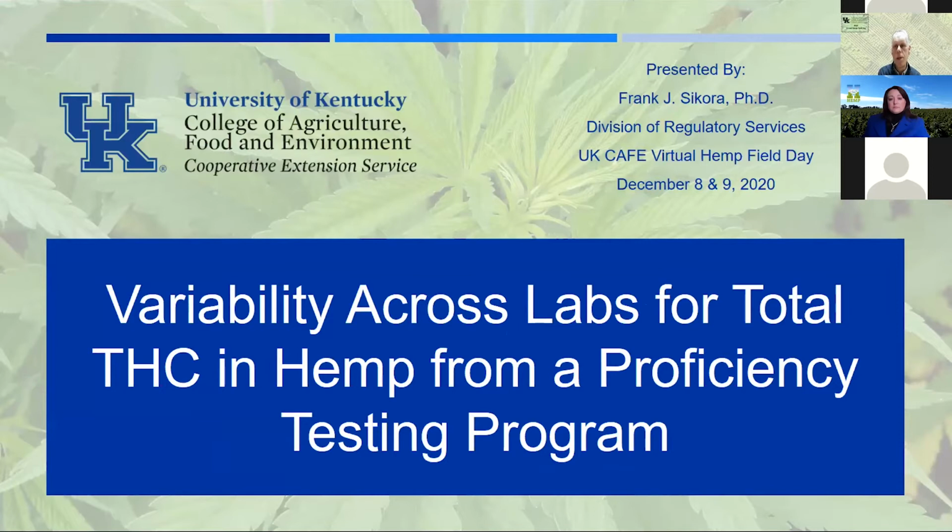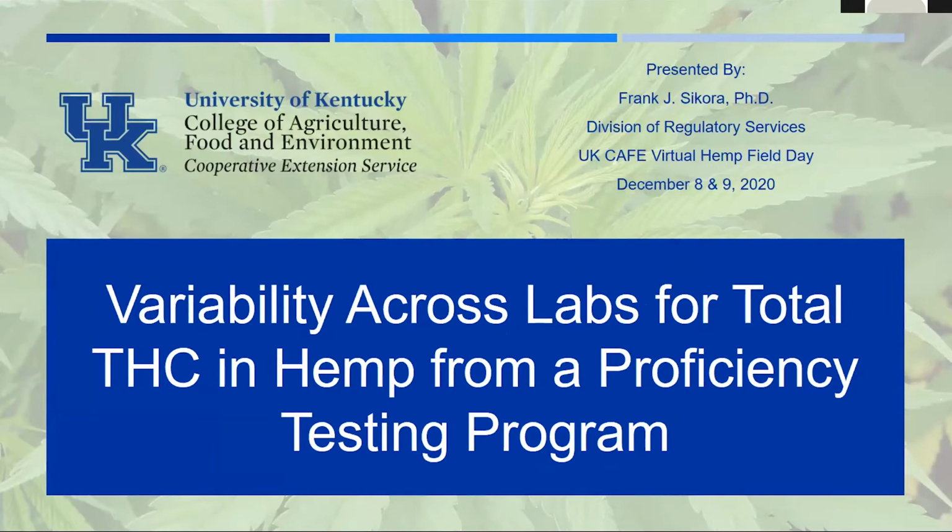I'm going to be discussing some data from the hemp proficiency testing program that we manage. We got involved in testing hemp for total THC for the Kentucky Department of Agriculture a few years ago, in 2017. When we first started, there was not a proficiency testing program, and I realized the need for one.